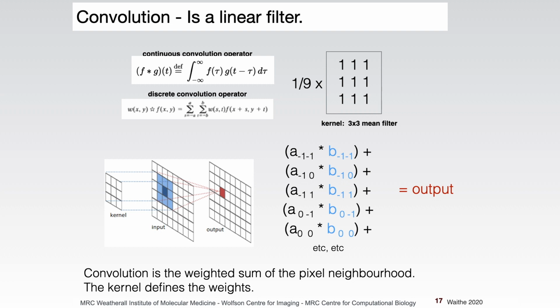And then if I was to increase that, what's going to happen? The power of the averaging gets more. You'd have more and more smoothing effect. The problem is it's a very square filter, so you also introduce a little bit of an artifact with that if you get really big.